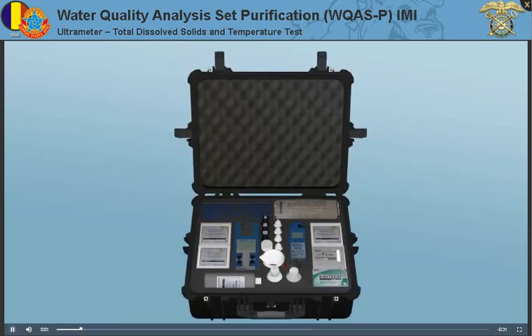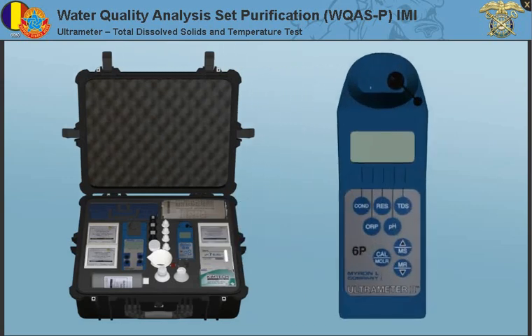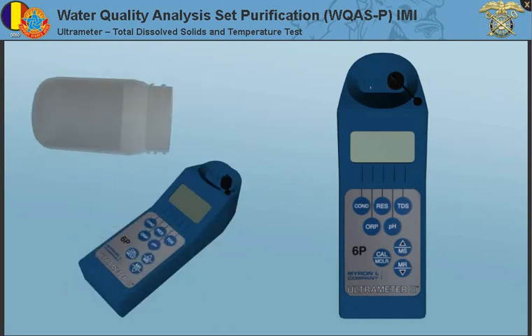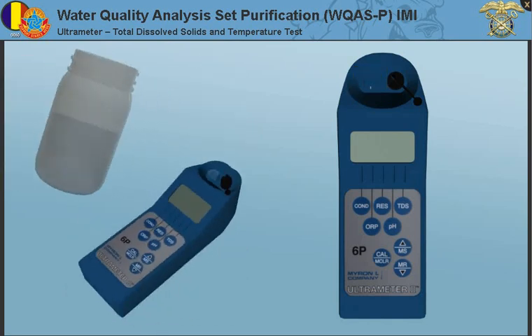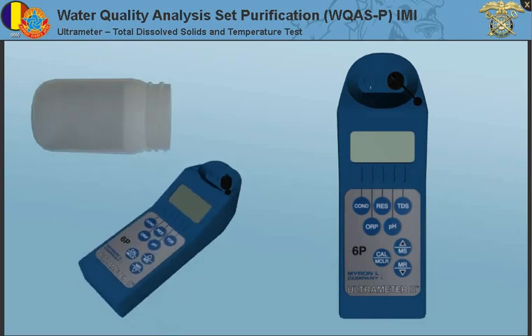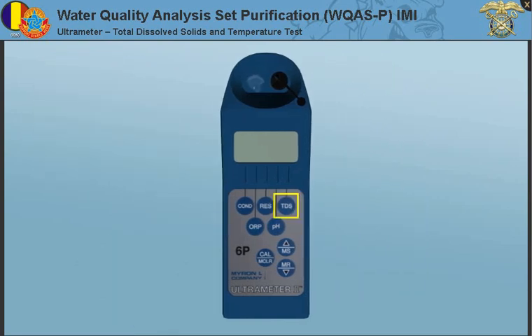To measure the total dissolved solids, or TDS, in a water sample using the ultrometer, rinse out the cell cup — which is the well on the top left of the meter — three times with the sample water to be tested. When rinsed, refill the cell cup with the sample water and press the TDS key.